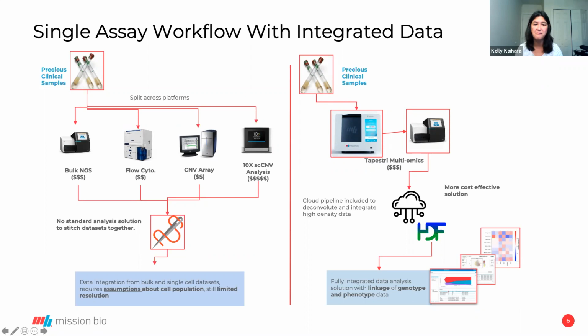We're layering on more and more analytes. We started off with DNA and SNVs, we recently included copy number variation, and now we're moving on to protein expression. From that same single cell, you now get information across many different analytes, and from thousands up to 10,000 single cells per sample to boot. The amount of information that we're getting from a single sample has astronomically increased.